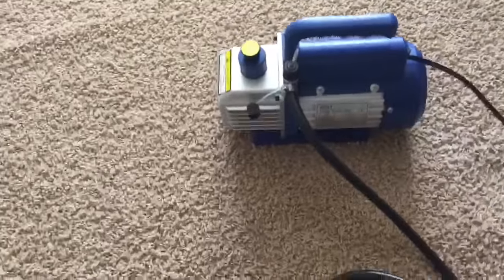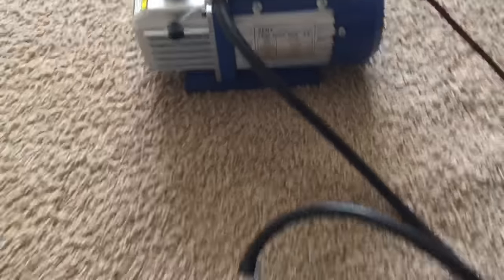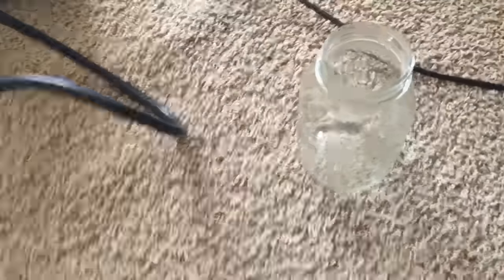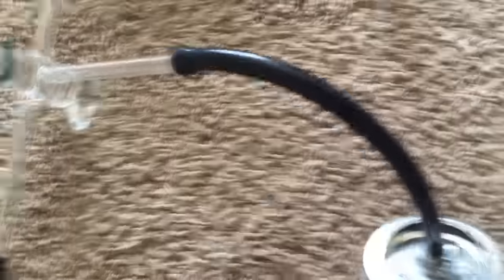I've got a vacuum pump right there — single vane, single stage vacuum pump — and I've got a mason jar with a modified lid to put a vacuum hose on it. I've also got a three-way stopcock and this plastic container right here.